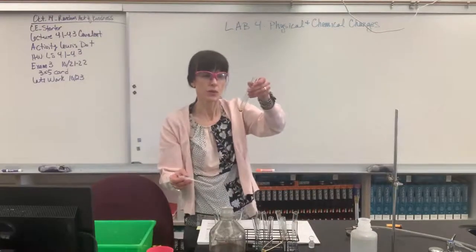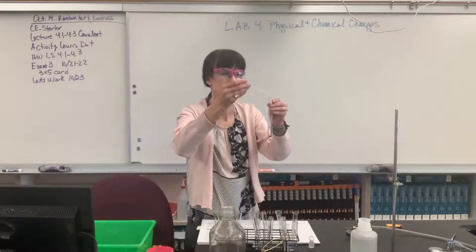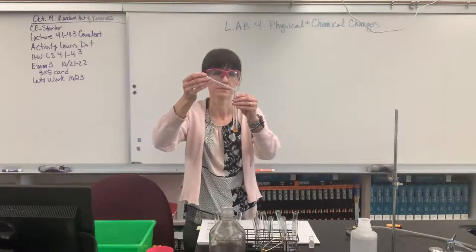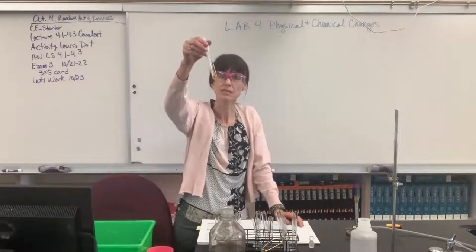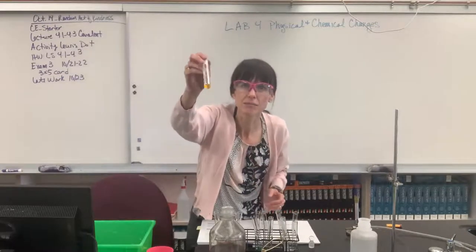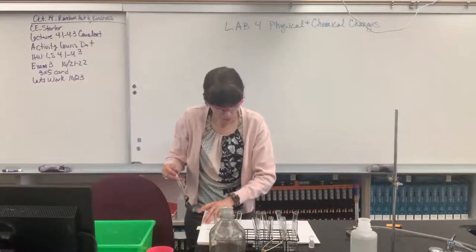All right, so remember when we heated this, it went that beautiful red color? Let's add water to it, see what happens. We're going to do our 30 drops of water. So I added my 30 drops of water. Let me mix it. Interesting, yellow. It started out yellow. We cooked it, it melted into that brilliant red and it is back to a yellow. And it's a clear yellow too, it's not opaque. You can see through it. Let's see if we record that.